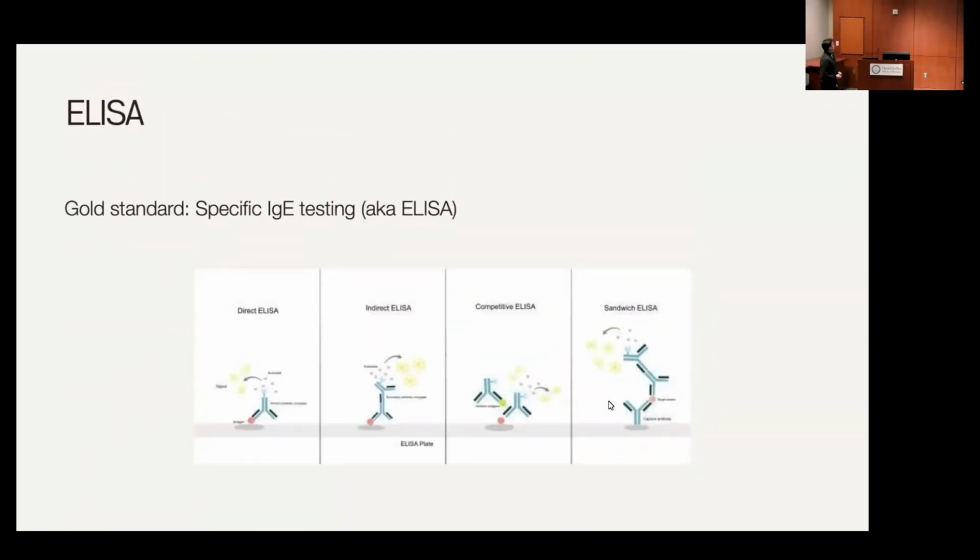So now we can go ahead and begin discussing the different ELISA research protocols. To reiterate, it's used to detect and quantify soluble substances, as I just mentioned, antibodies and antigens. In our case, we want to see whether or not IgE is present. We'll get to that in a little bit. On the screen, there are four main techniques housed under the ELISA method. We have direct, indirect, competitive, and the sandwich method. We're going to be discussing all of these methods except for the competitive ELISA method.